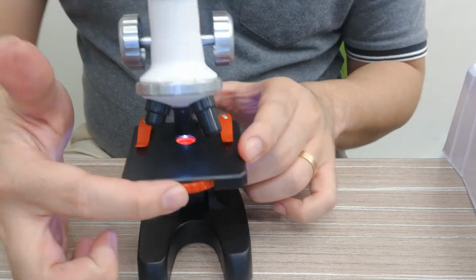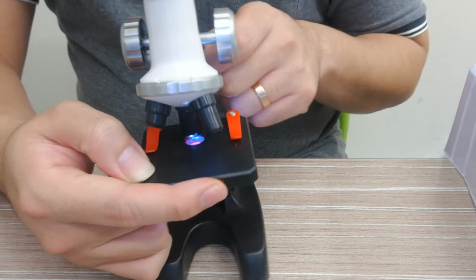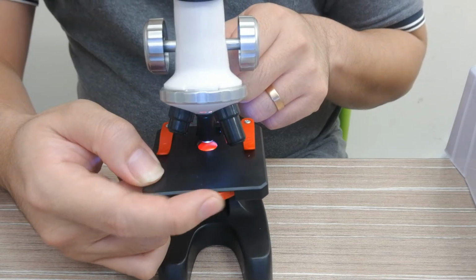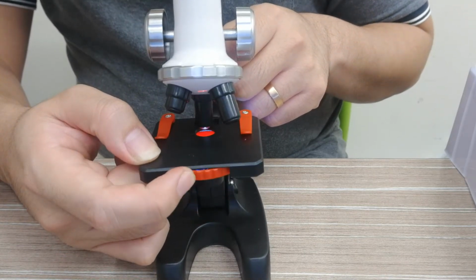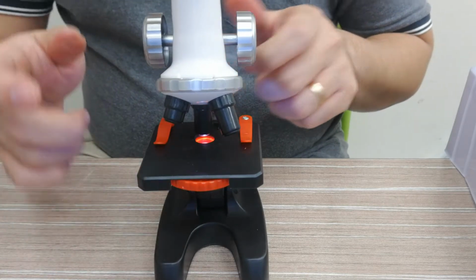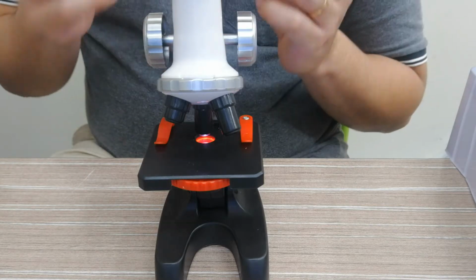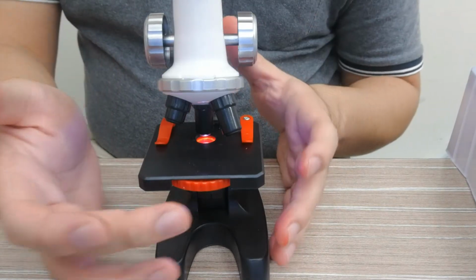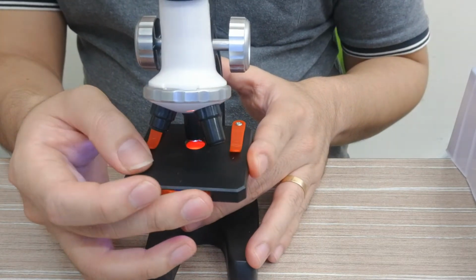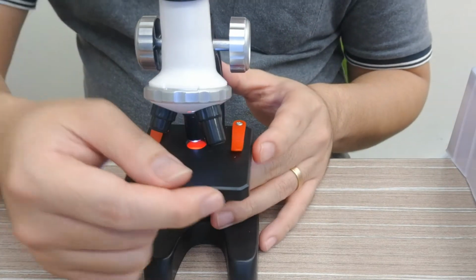And over here you can see there's a dial. This dial is meant for you to change the background. Now you can see the background is blue, green, red, and we have fully transparent, and we have small. This is for you to adjust when you observe different kinds of plant or material. For example, pollen, you need to have a different screen. But if you want to look at onion, then you need to use a different screen as well.